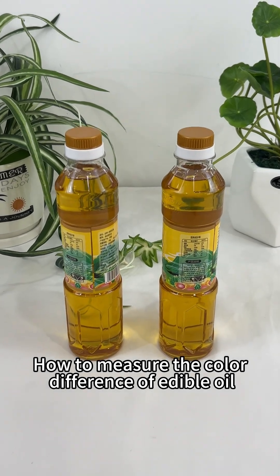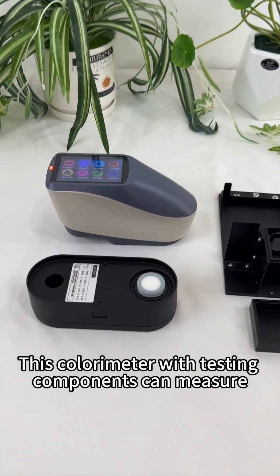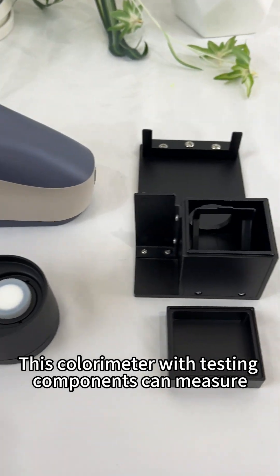How to measure the color difference of edible oil? This colorimeter with testing components can measure color differences in edible oil samples.